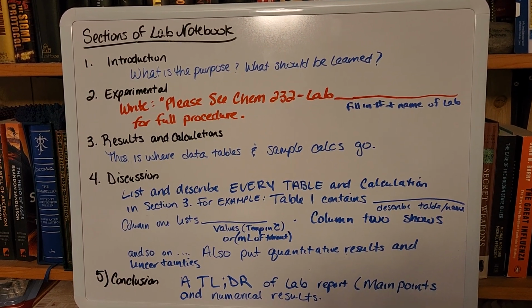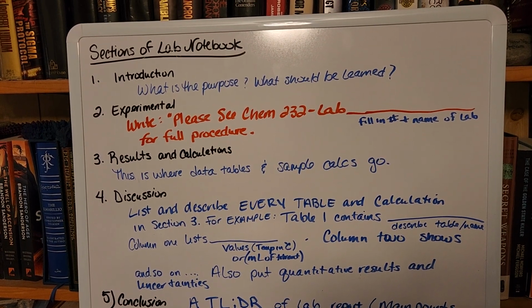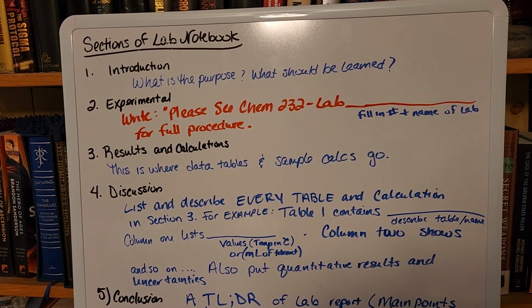Your experimental section is the easiest, and you literally just write, please see Chem 232 lab, and then you fill in the lab number and the title.